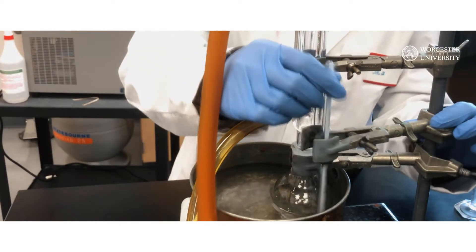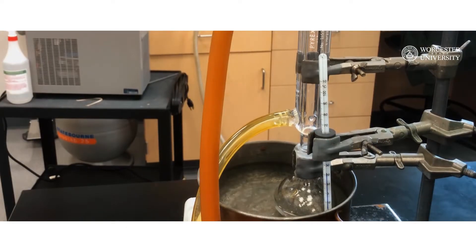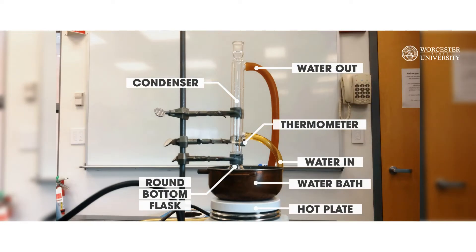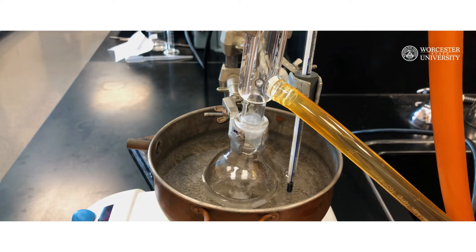Place a thermometer inside the water bath to monitor the temperature. You can clamp the thermometer to a stand to keep it straight. Here is the full reflux setup — take a moment to pause if you need to sketch it down in your lab notebook. Once you finish your setup, heat the flask to reflux with stirring until most of the trans-stilbene has dissolved.